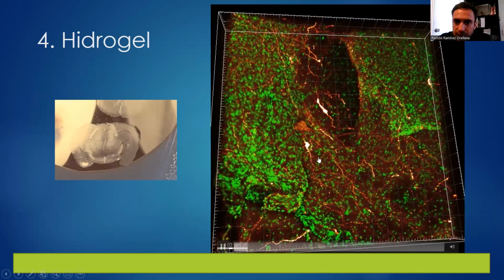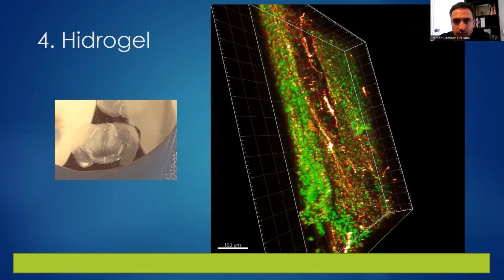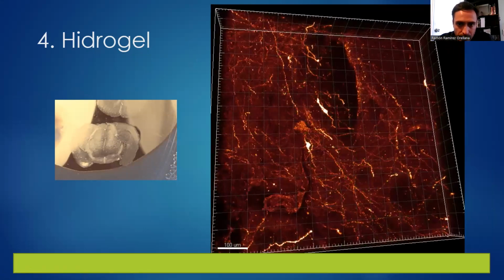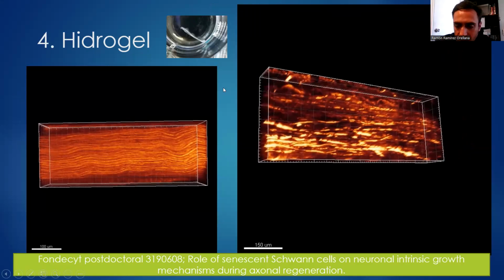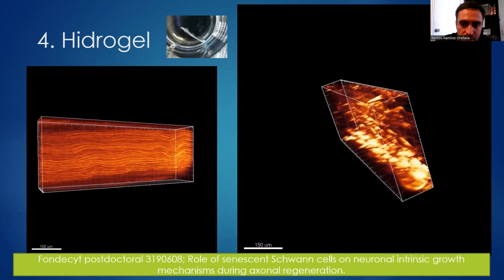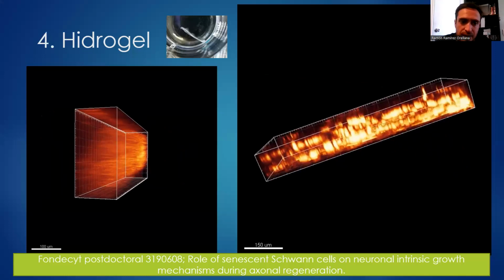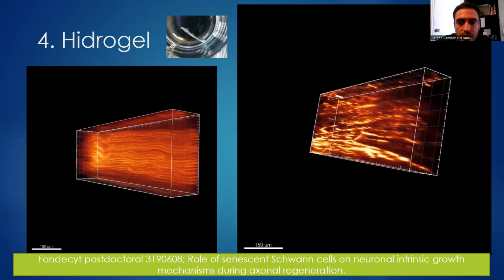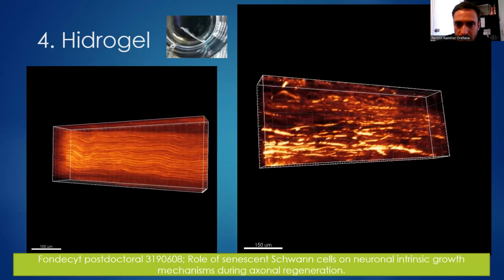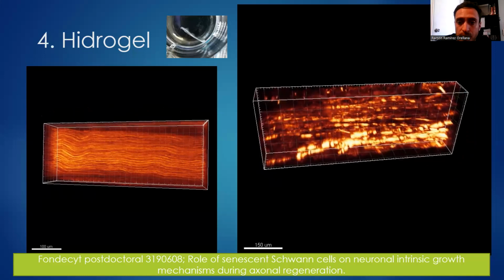Bueno, estas son algunas fotografías que hemos tomado, en este caso con el anticuerpo de la beta-3 tubulina en cerebro, también en nervio ciático, ¿ya? Hemos obtenido buenos resultados en el sentido de que ha penetrado bastante el anticuerpo, a pesar de que tuvimos al principio muchos problemas con diferentes técnicas de Clarity, e incluso con esta también, pero ya hemos logrado con algunas soluciones que le voy a dar después, obtener bastante penetrabilidad de los anticuerpos que hemos utilizado.